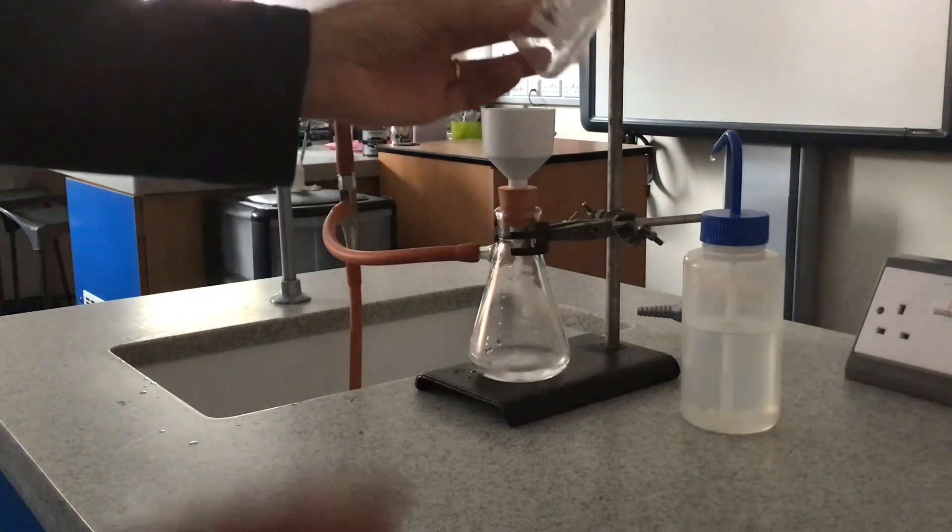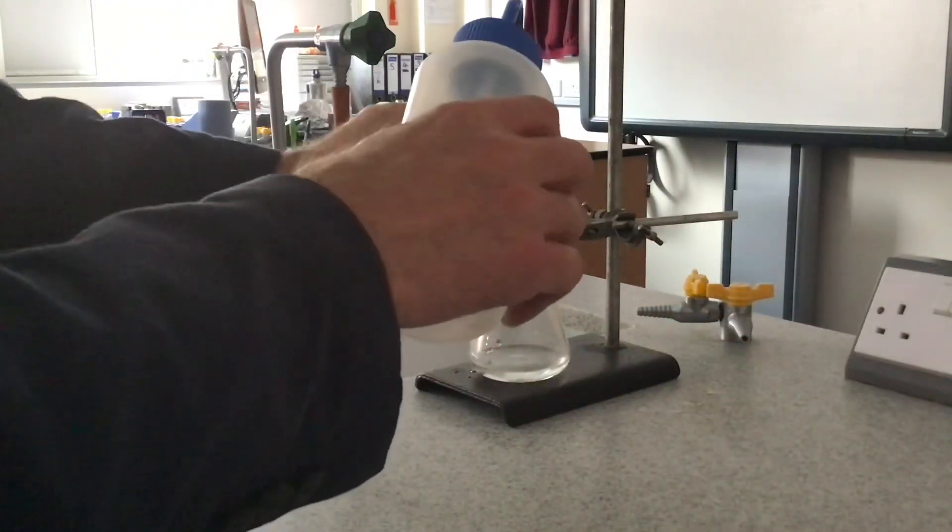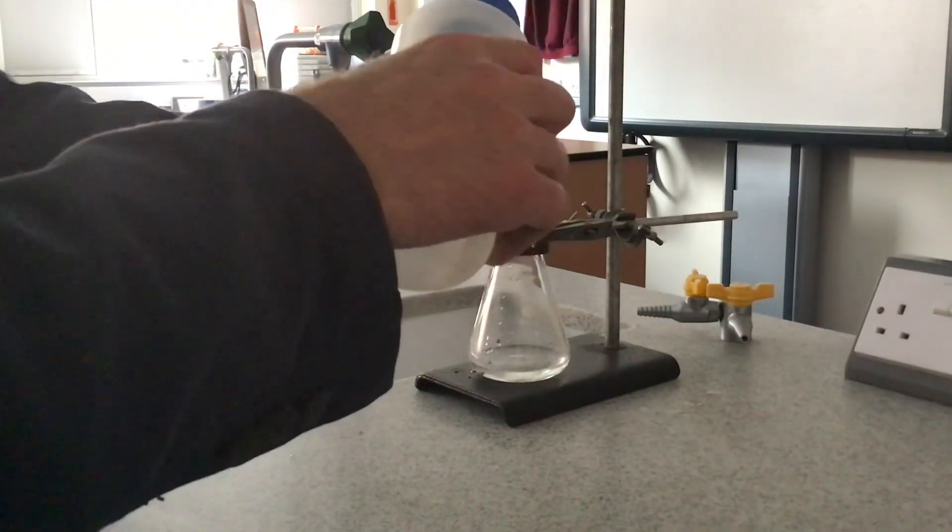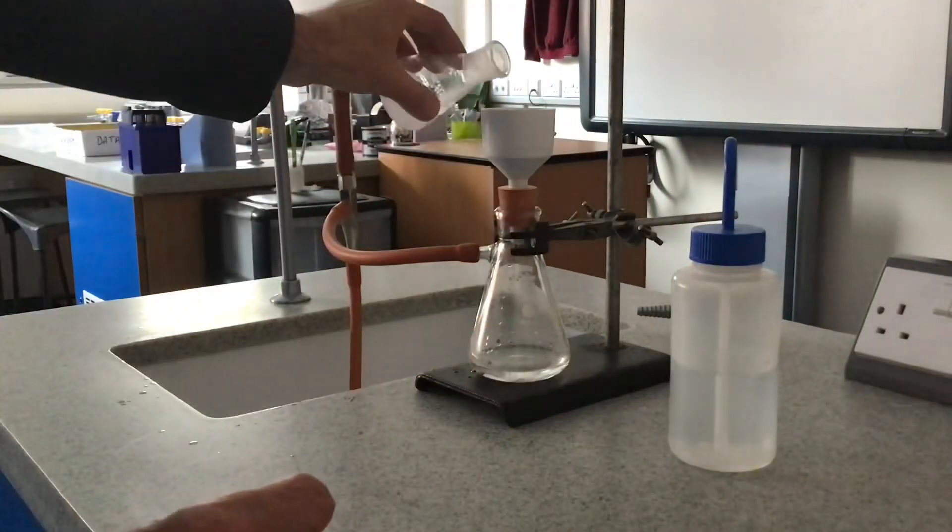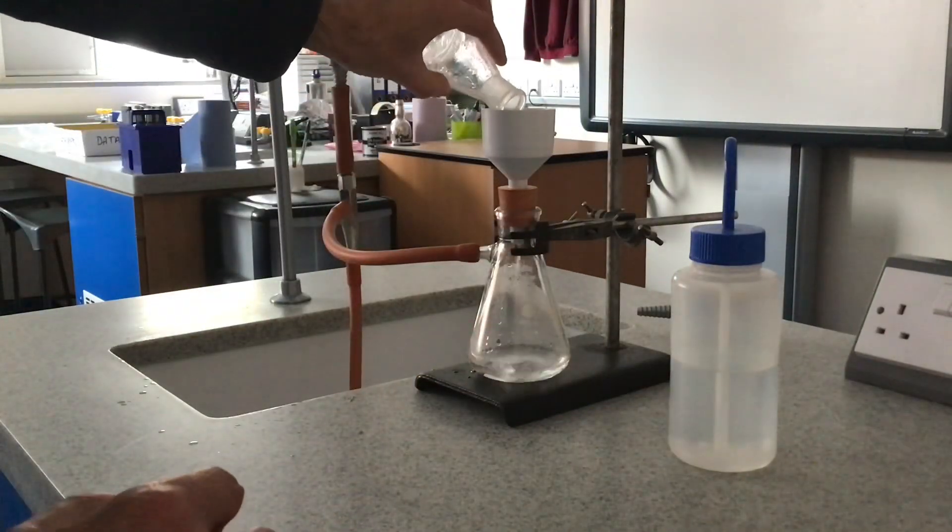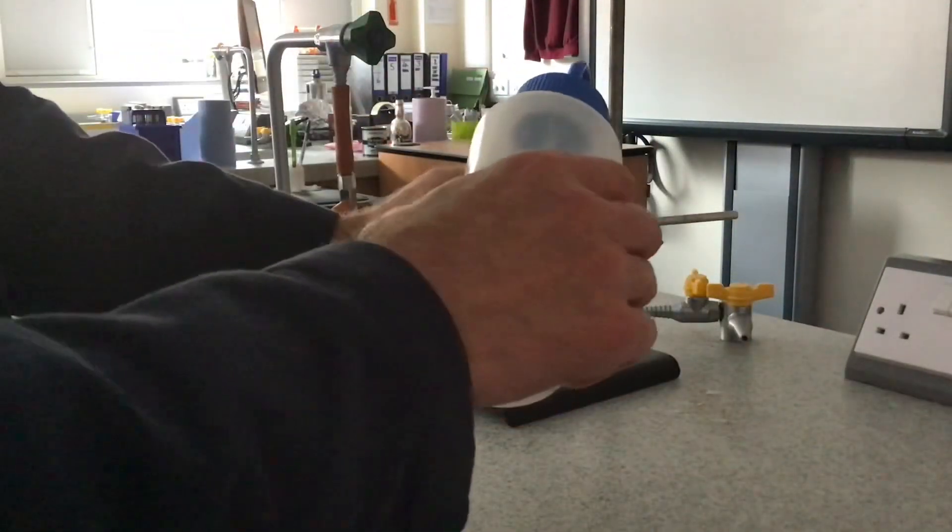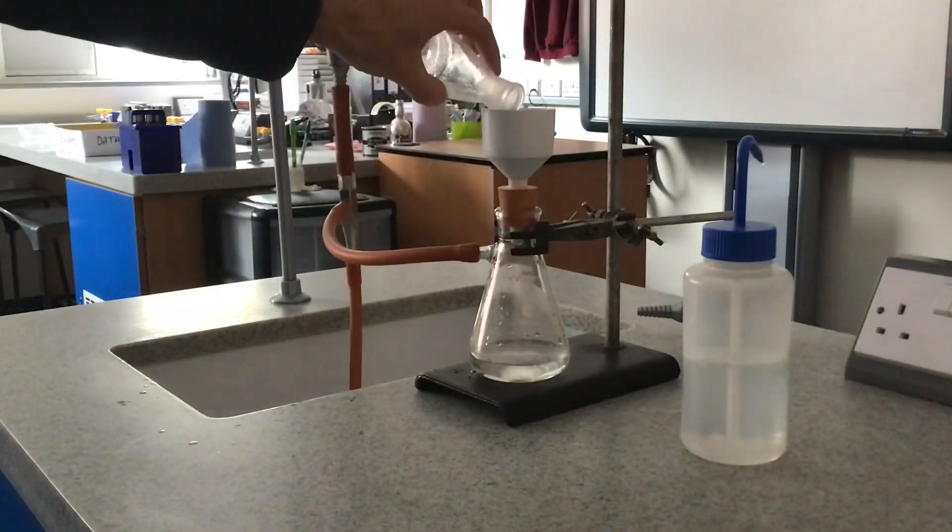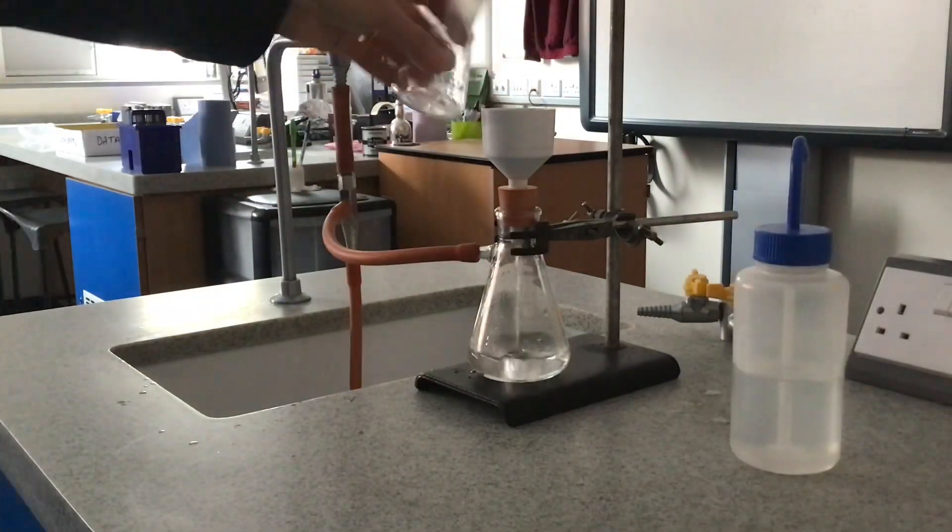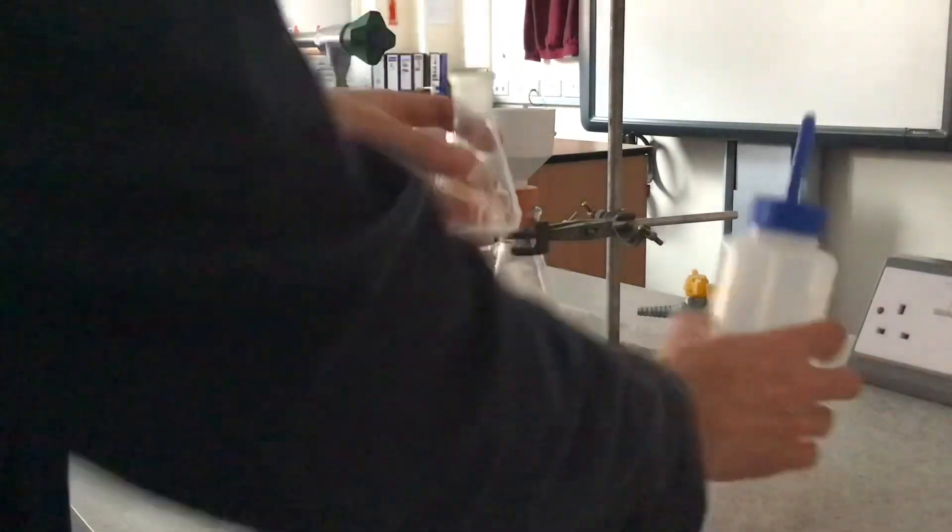You'll notice I've got quite a bit of solid still in the flask there, so I just need to rinse this out with the solvent that I'm using. This should be cold solvent so that we don't dissolve the solid. Just pour that through. Still got some in there so I'll just keep going with that. Last one.